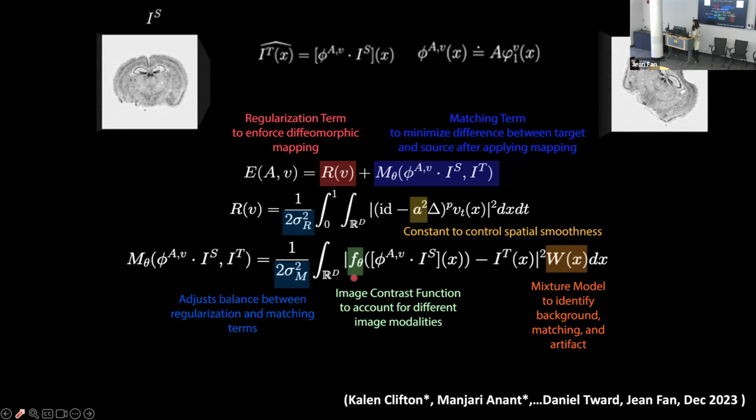But we have explored, actually, creating this rasterization by incorporating the transcriptional information. You can imagine the amplitude of your Dirac function could be either a PC or the expression of some genes. But then you're incorporating that gene expression into your alignment itself, so it might not be too kosher to evaluate the transcriptional similarity and difference. Great question. For now, we're just looking at cell density and trying to align these structures.